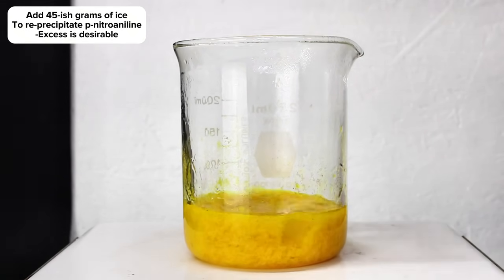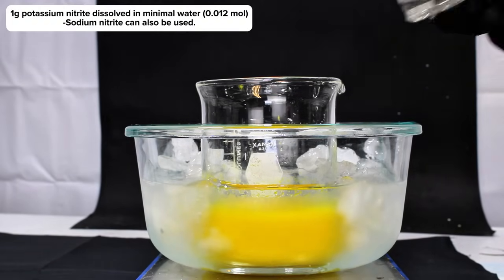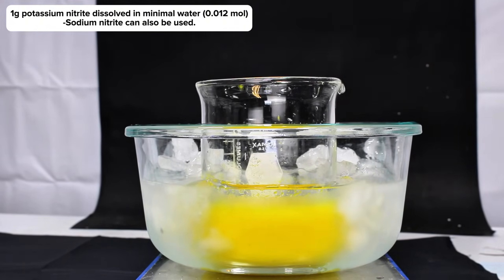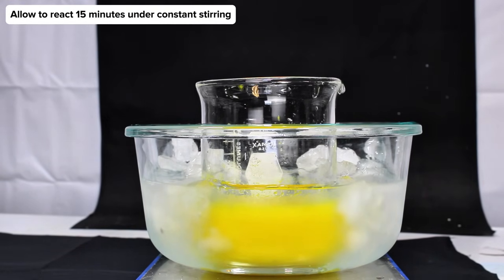Most of the ice will end up melting here, but there should be at least a little left to guarantee that the reaction mixture is sufficiently cold. This beaker was next transferred to an ice bath, and to it I added 1 gram of potassium nitrite dissolved in about 3 milliliters of water under constant stirring. This was allowed to continue reacting for about 15 minutes, which resulted in a lightening of the mixture as the reaction proceeded.